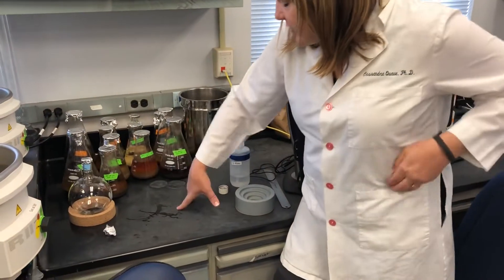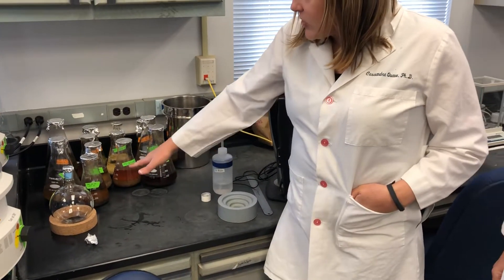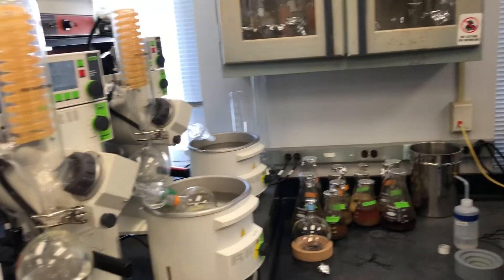These are in the second maceration stage according to the label. They're almost ready for filtration and then we're going to put them on the Rotavaps.